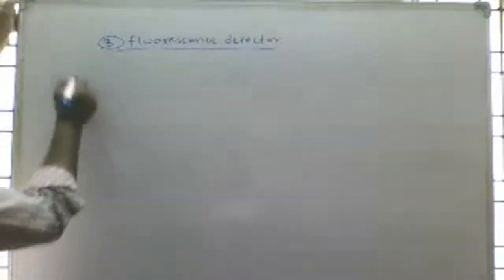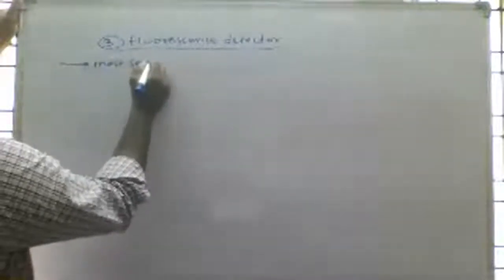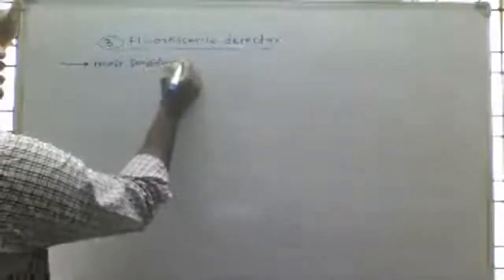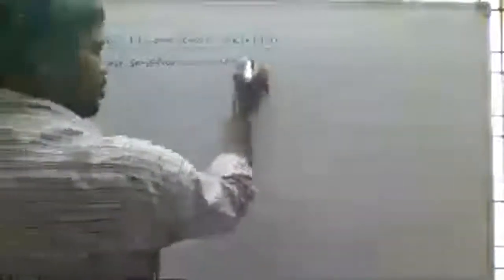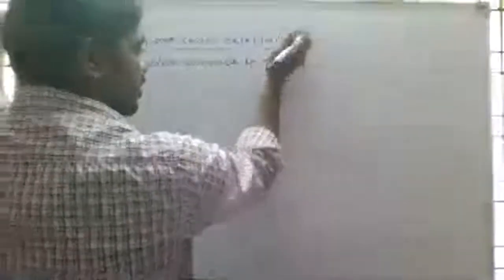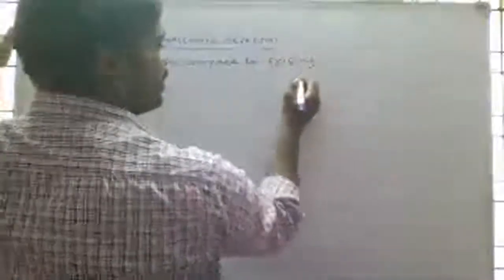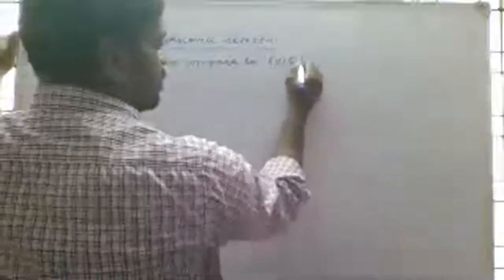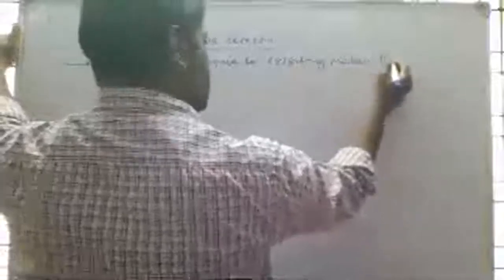So these are fluorescence detectors. The fluorescence detector is the most sensitive compared to existing modern HPLC detectors.